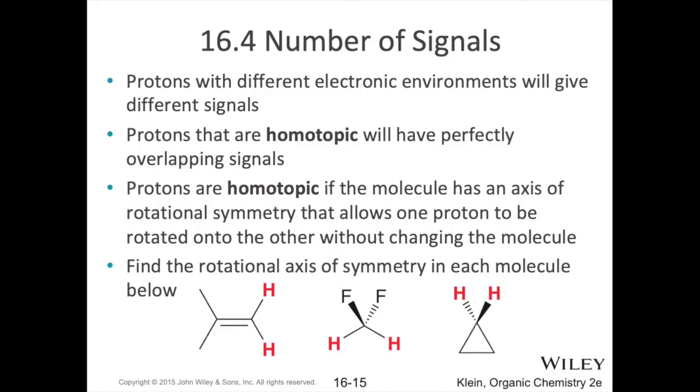Okay, so for example, if you look at this molecule here, I'm comparing these two hydrogens over here, those two protons. By the way, I've been using the words protons and hydrogens interchangeably. These are technically hydrogen atoms, but since it's the nucleus of these atoms that interacts with the NMR, remember the nucleus of a hydrogen-1 atom is just a plain proton, so that's why I'll sometimes refer to these as protons.